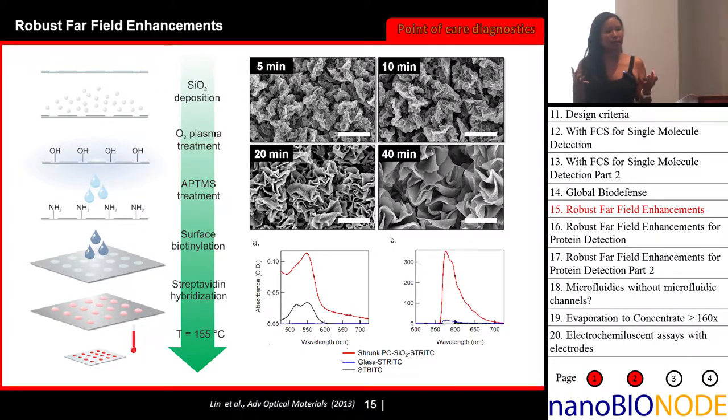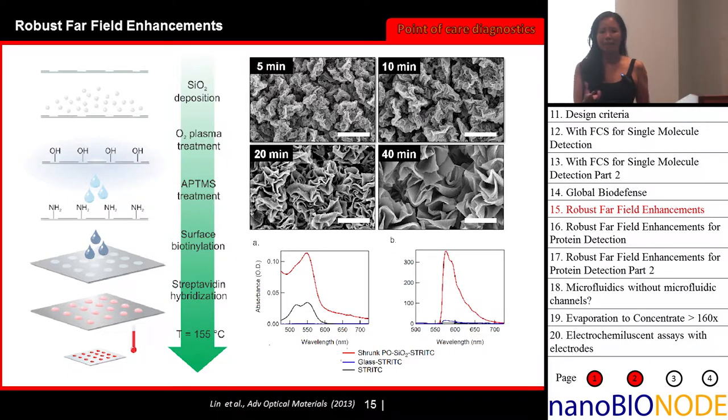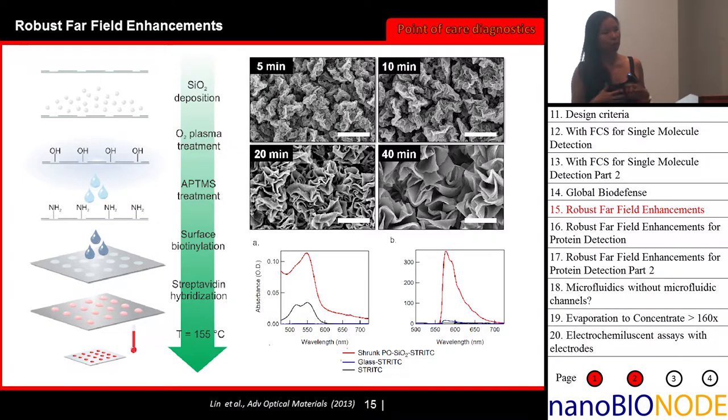I'm talking about being able to pick up single molecules, and what we're doing is letting that molecule diffuse across these structures. Every so often you would see a blip, right? And this is two-photon excitation, so the setup is still very expensive, and it's a near-field effect. It's not that everything that comes near the surface gets lit up. The metal-enhanced fluorescence effect is a near-surface effect, so it drops off after about 40 nanometers from the surface. It has to be really, really close to those nanostructures. So this wasn't really quite what we were looking for. We wanted something more robust that would give us a far-field effect.